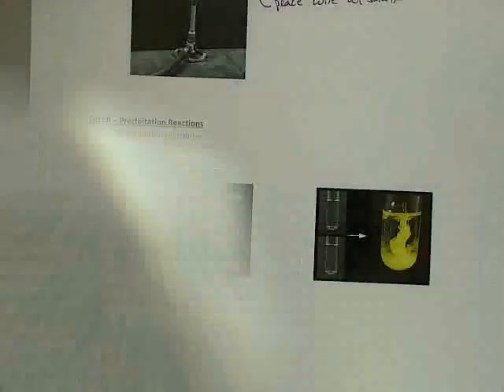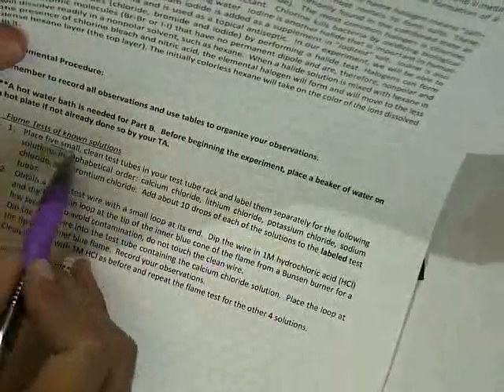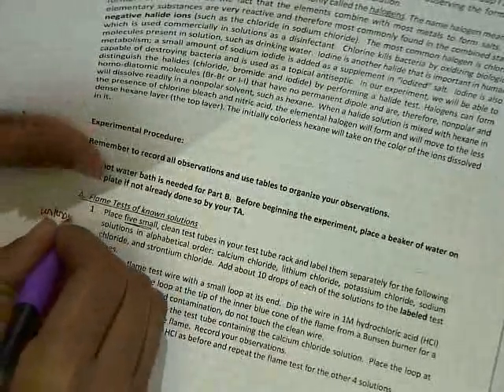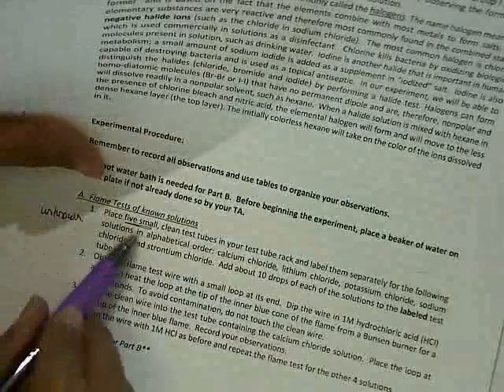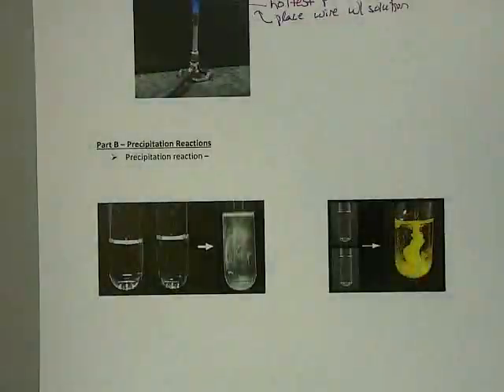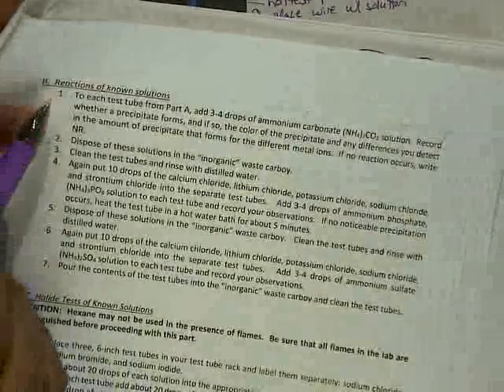Part B, so you're going to be saving your solutions from part A. When you've done all 5 compounds, you should also here add your unknown instead of going back and redoing it. So maybe here add a test tube of your unknown. It's going to save you a lot of time in lab. When you're done with this, move on to part B.